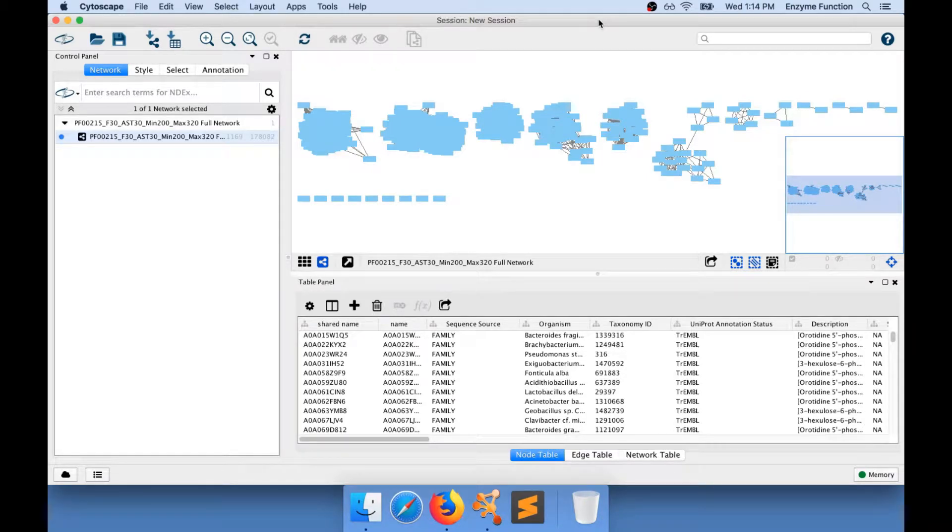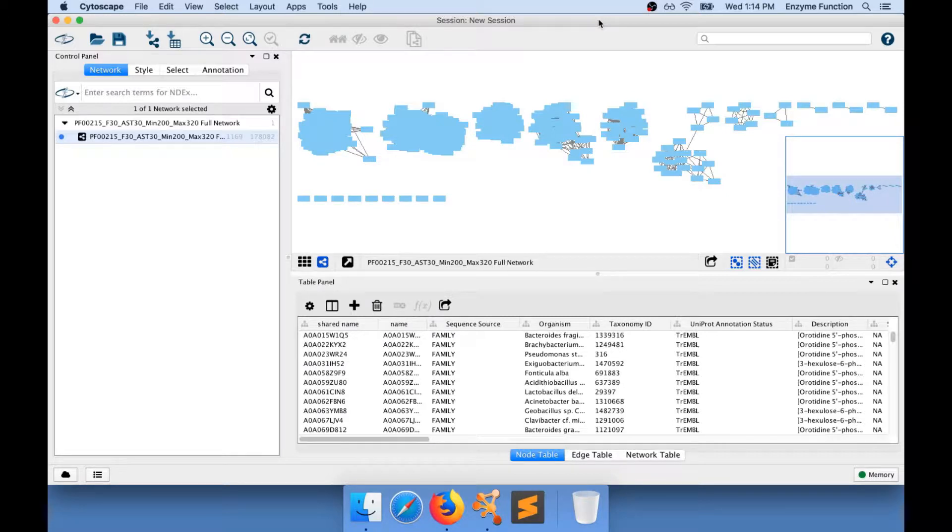Here, I have a protein sequence similarity network that I have downloaded from the EFI website. I have loaded it into Cytoscape and I have applied a layout.